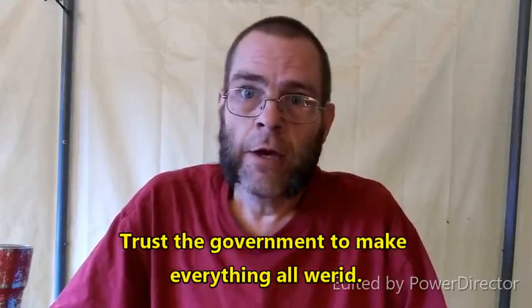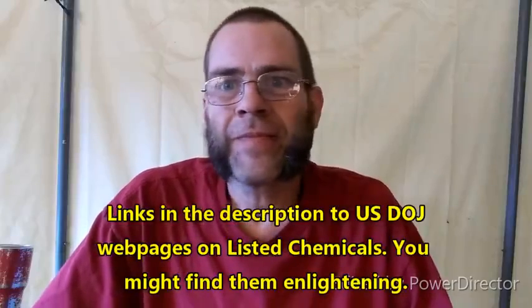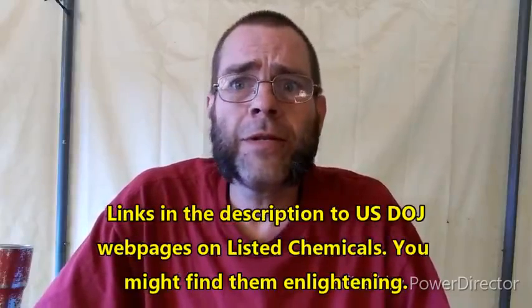Of course, the DEA has it on List 1. Yay! Which means that trying to buy it is next to impossible, and will probably get you a knock on the door. I'm a little surprised I didn't get one buying the phthalimide in order to make the damn stuff. Again, the reason it's on List 1 is because people use it to make methaqualone.